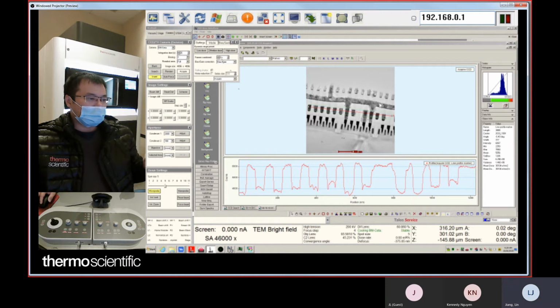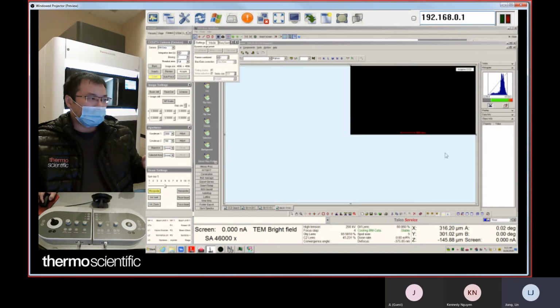It's not 8,000 anymore. If you have 4 frames, the max count allowed is 32,000. So right now we combine 2 frames, and with integration changed to 2, we can acquire another image.